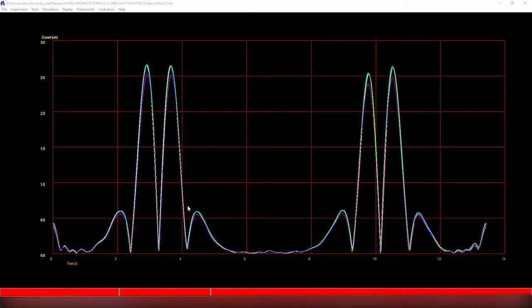This is, again, the fourth harmonic, so the midpoint potential here is where your reversible potential is also occurring for your reaction. Other points of interest may also be here, where you can see a very small amount of ringing, which is due to how we extract the harmonics.